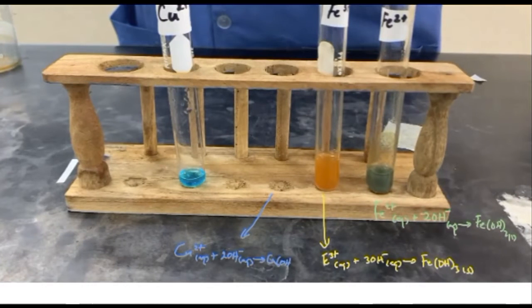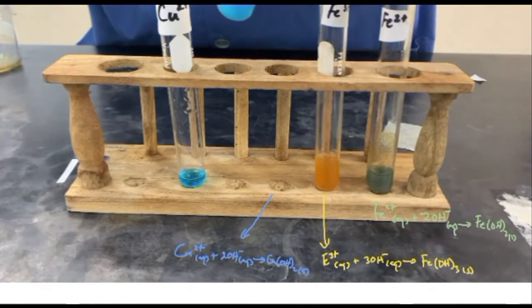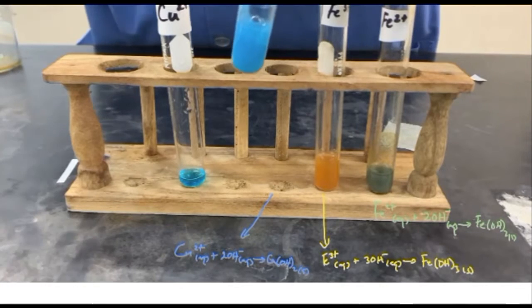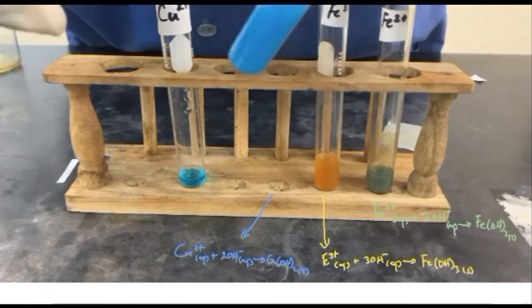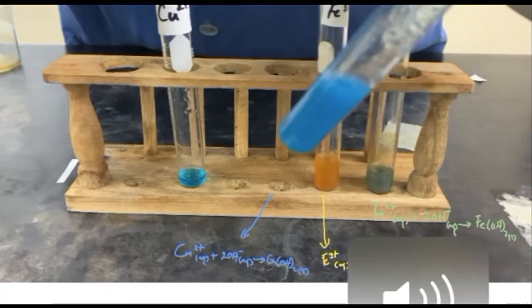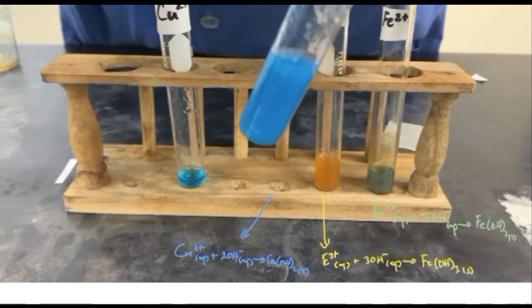So we want to check. We want to add the base in excess to see if our precipitate will dissolve. And we're seeing that our precipitate is not dissolving.